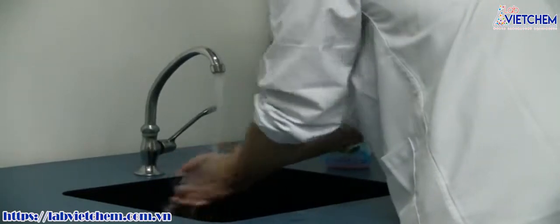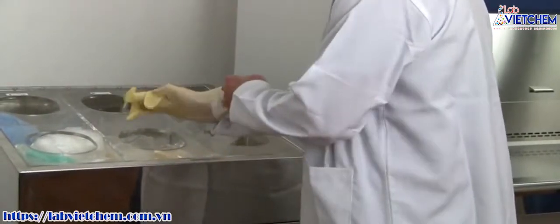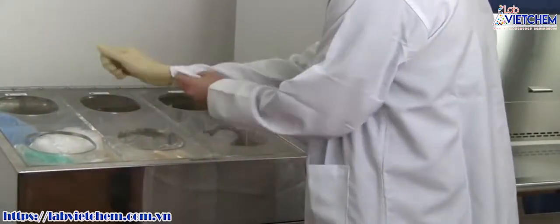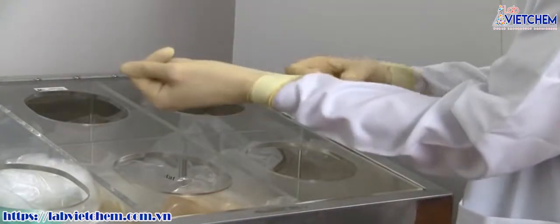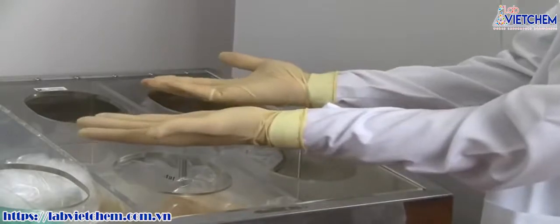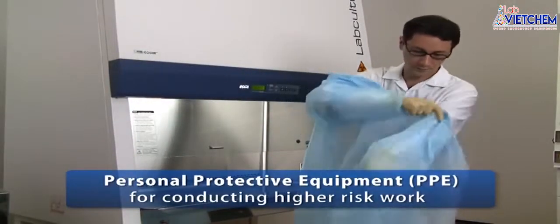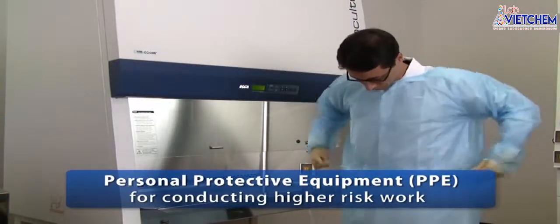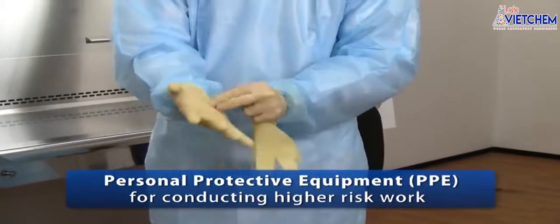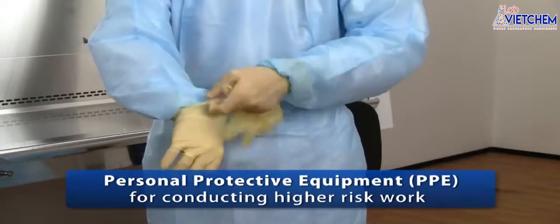Before donning your protective clothing, wash your hands thoroughly with germicidal soap. When conducting low-risk work, wear a long-sleeve lab coat and latex gloves. Ensure the gloves cover the cuffs of the lab coat. For higher risk work, such as Biosafety Level 2+ and Biosafety Level 3 work, a solid front long sleeve gown and 2 pairs of gloves are more appropriate. Make sure the top gloves cover the gown's cuffs. There should be no exposed skin.